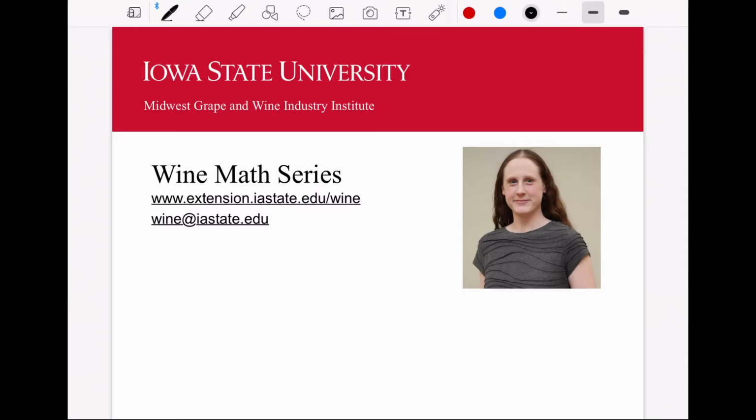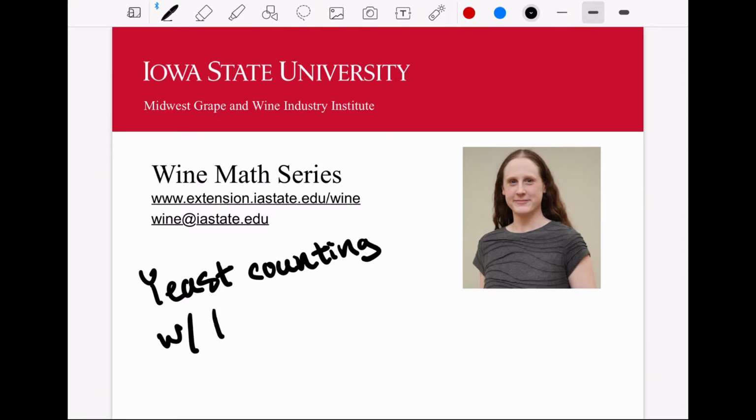My name is Maureen Moroney, and in this video we'll be going through some calculations for yeast counting with a hemocytometer.